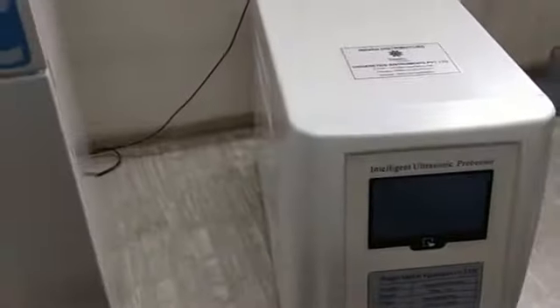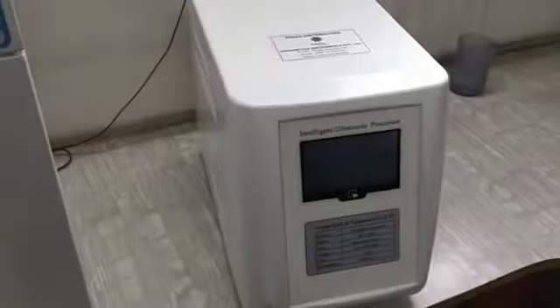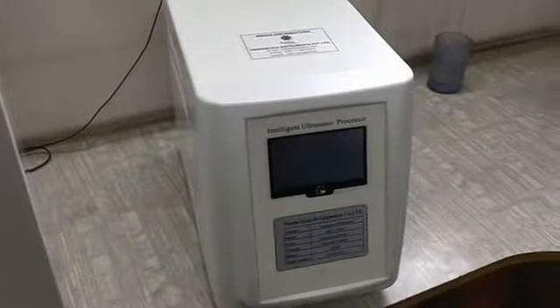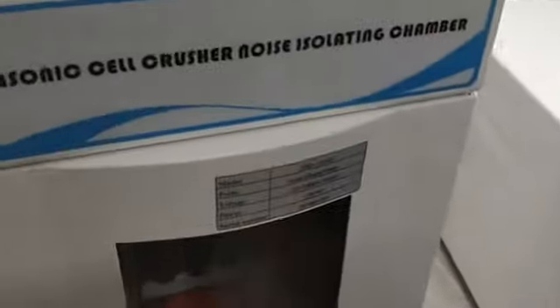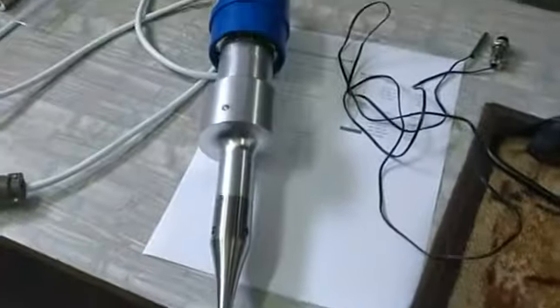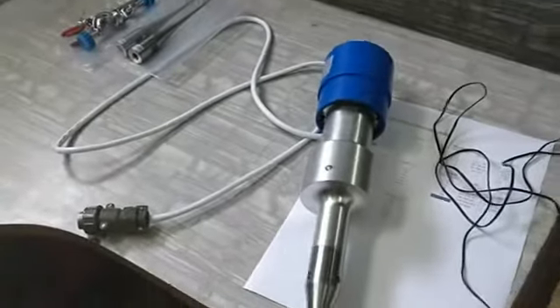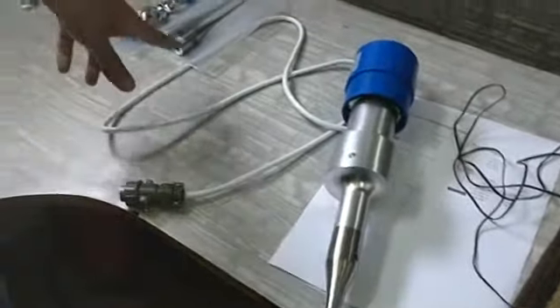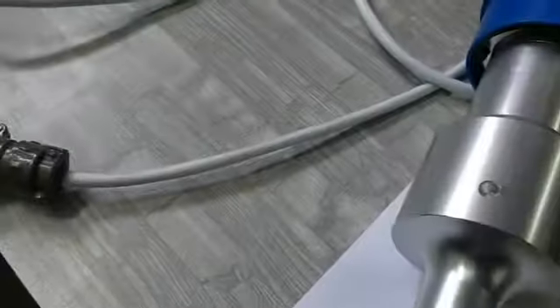First of all, these probes can be put in one transducer only. The first thing we are going to see is how we can change the probes. This is our transducer, and now we are going to demonstrate how we can change the probe. Here you can see the customer has purchased 2mm dia, 3mm dia, and 6mm dia probes.